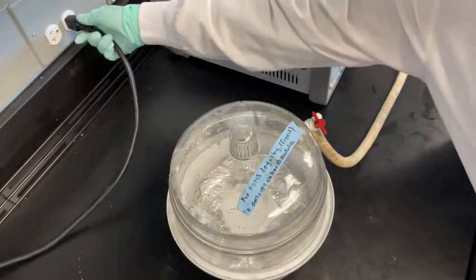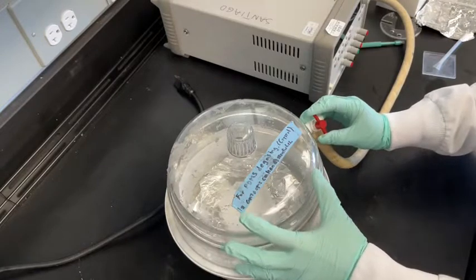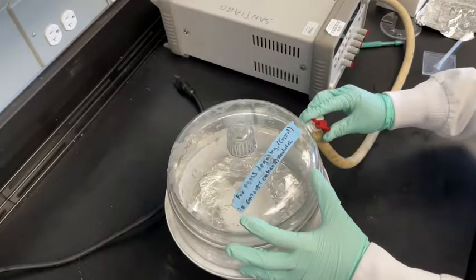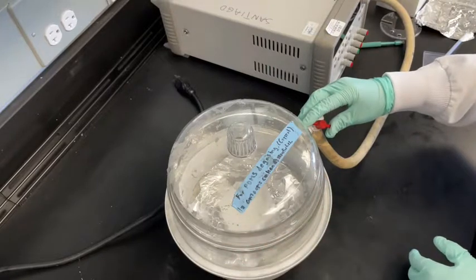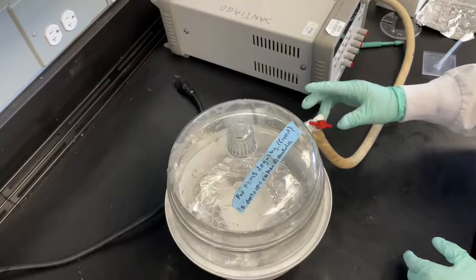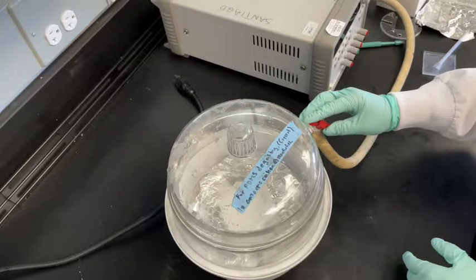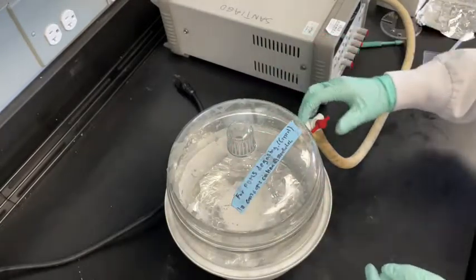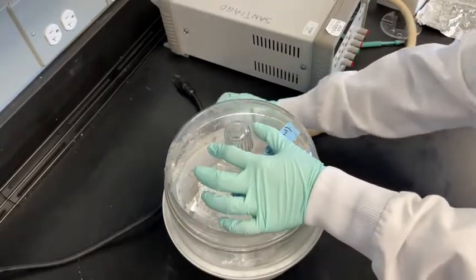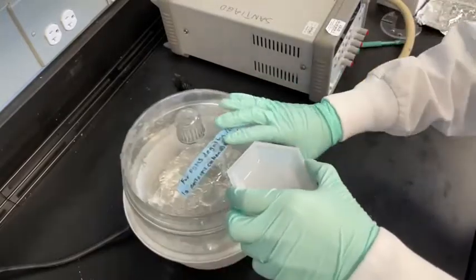First, unplug the black cord to turn off the vacuum. Then, slowly open the red valve to re-pressurize the chamber. Then remove the boat from the chamber, being sure to avoid spilling.